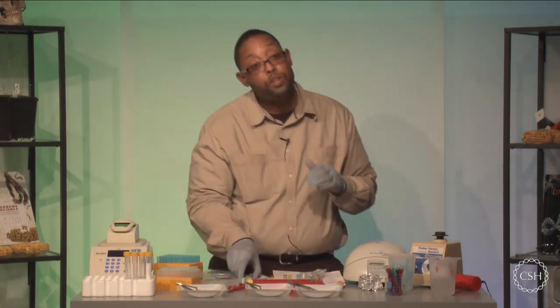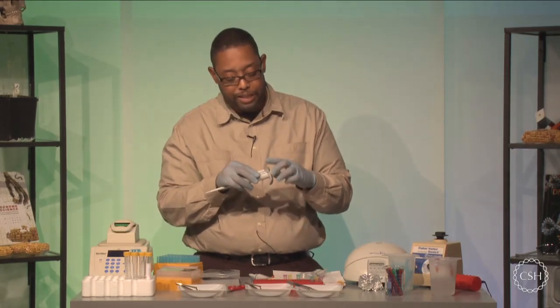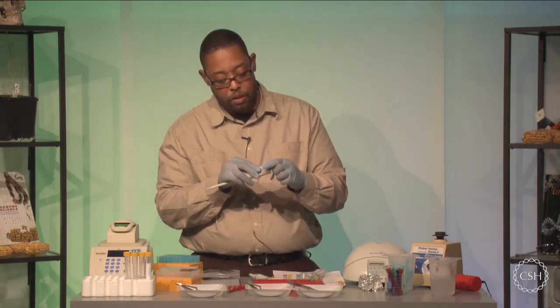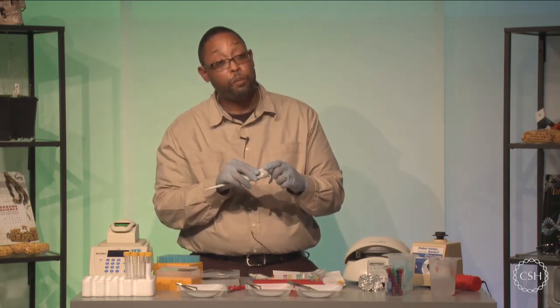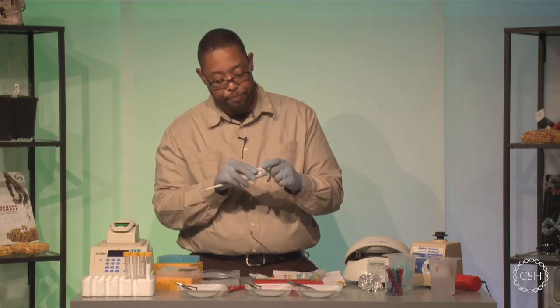Now, although we put 100 microliters of fluid in there, to ensure that we don't pull any of the silica resin over, I'm going to say dial your pipetter down to about 90 microliters so that we only pull up 90% of the actual sample here. This will make sure that we don't go into the pellet and draw up anything that could be potentially bad.